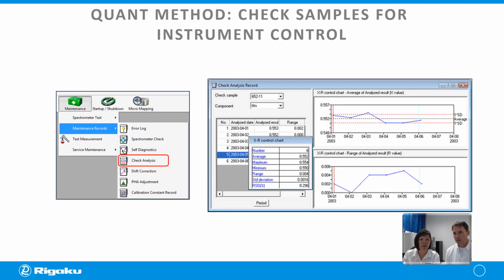And then it also trends it for you as well. So if you set it up for your check samples or even your drift, it will trend it for you, just like you would in Excel, where it draws your acceptance or your specs. All the control charting is all within the system.